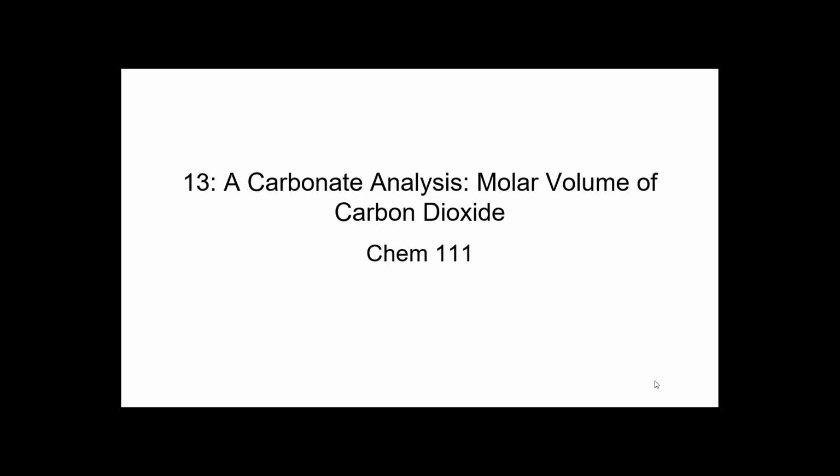Hi class. So you have a lab this week of a carbonate analysis, molar volume of carbon dioxide. This is a lab that we do in person and it's a pretty fast lab. The prep takes about 30 to 40 minutes and the lab itself, the experiment's about 3 to 5 minutes. So prep takes longer than the lab and that's what most students hate about it.